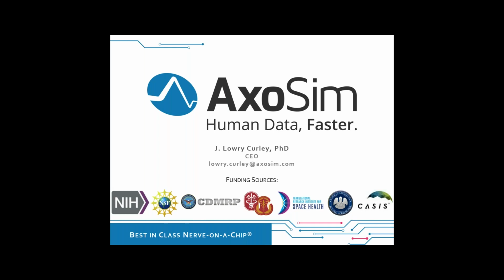That's really interesting. I know that these models built on human cells are now having to deal with human variability, which is kind of a new blessing and a curse at the same time, perhaps. Yeah, I mean, it's an interesting topic, and one that I think at first we were a bit frustrated with, is we would either get cells or whatever the case may be, and then even within the same lot, there were some differences. And so we've really tried to account for that through a stringent quality control system.